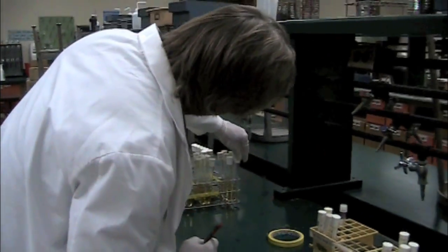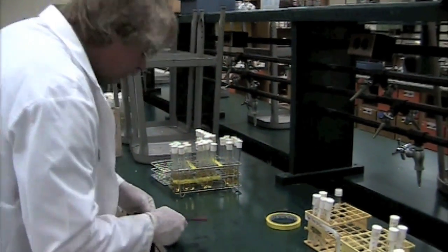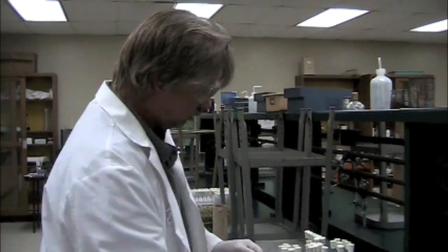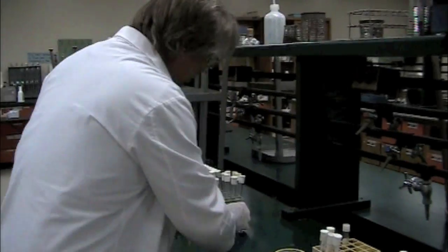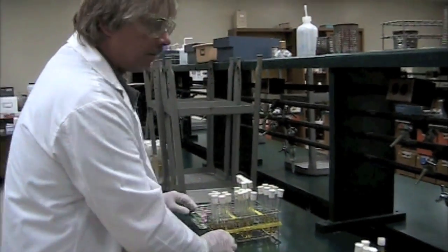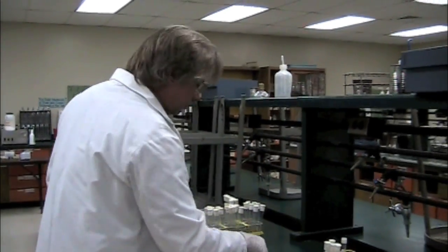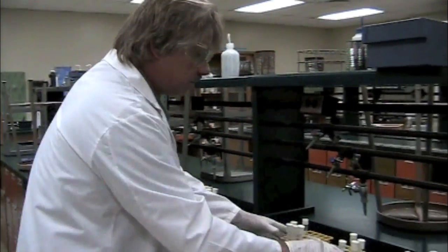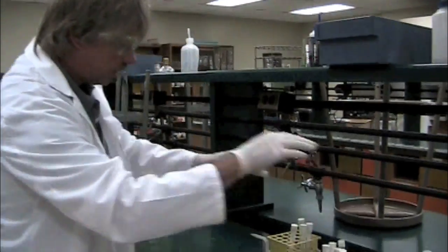I'm going to show you a transfer from a slant to a slant, and I'm going to show you a transfer from a slant to a broth. Okay? Alright, so what you guys are going to be using is some E. coli in the lab. Now I want to do this aseptically, and I want to do it by the book so that you guys can see how it's done by the book. These are the organisms that I need to transfer.